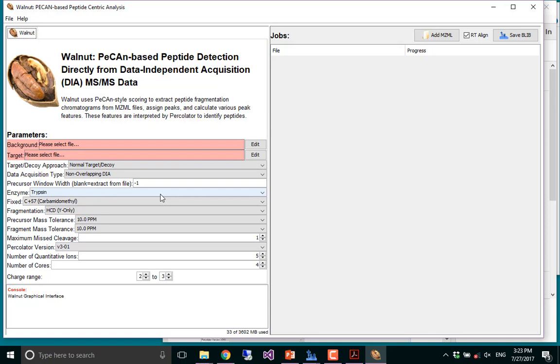You'll need to make sure that you have a new Java that comes with the installer that was available at the beginning.